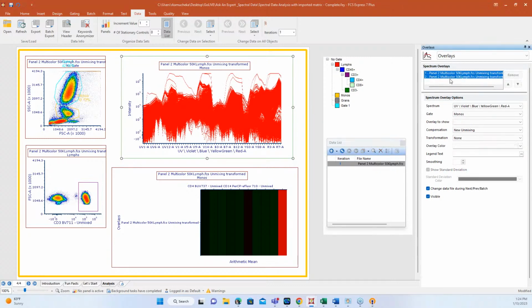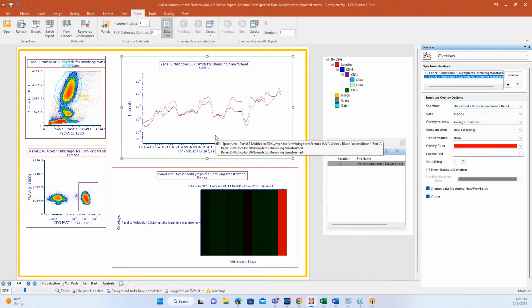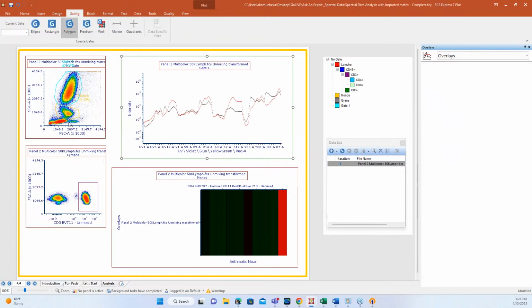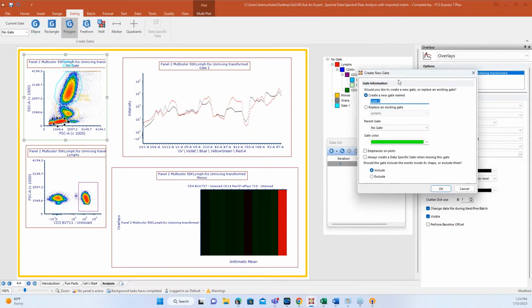I think mostly people get maybe not confused, but concerned about how it functions differently. They think because it's spectral data, all of a sudden the analysis is going to be really hard. As we're going through this, you can see when you're using color plots, it really does function exactly the same way that non-spectral data does. Once the data is unmixed, your populations should resolve, ideally the same way compensated data from non-spectral data would work.